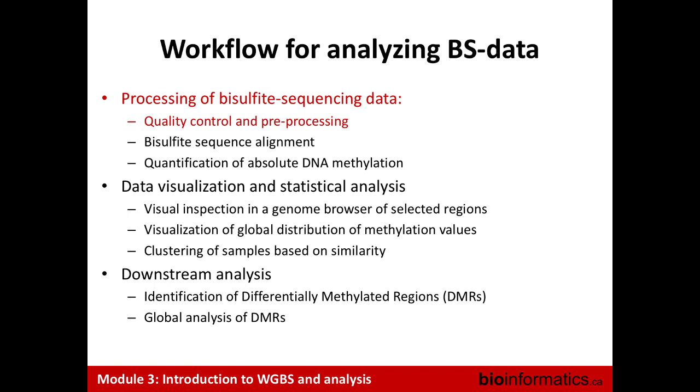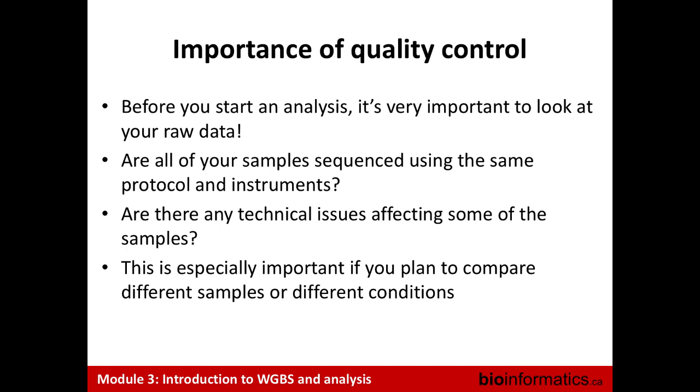Starting with a bit on quality control and pre-processing. This is going to be similar to what we did yesterday, and I won't go into as much detail, but as we were saying yesterday, it's very important that you look at your data. Were they all sequenced using the same protocol and the same instruments? If there are big differences in read length and you're comparing samples done using different read lengths, that's going to be a bit problematic. Are there technical issues? It's really important to look at the data.